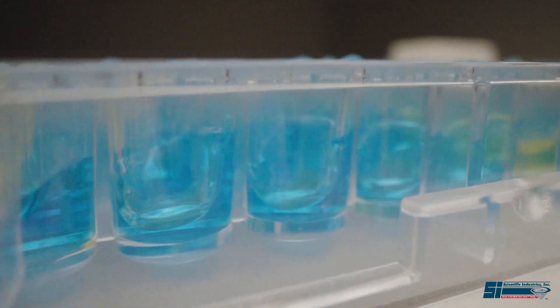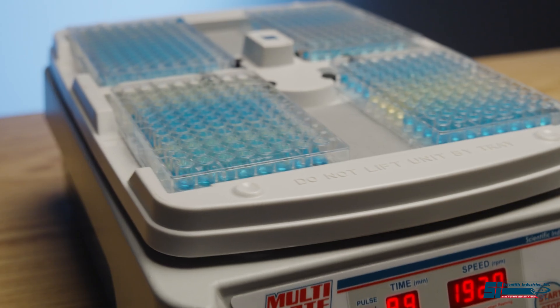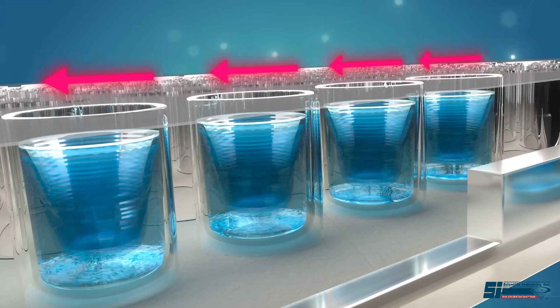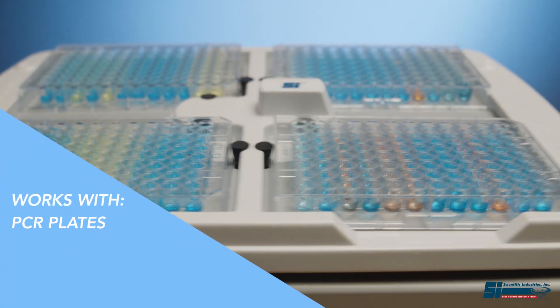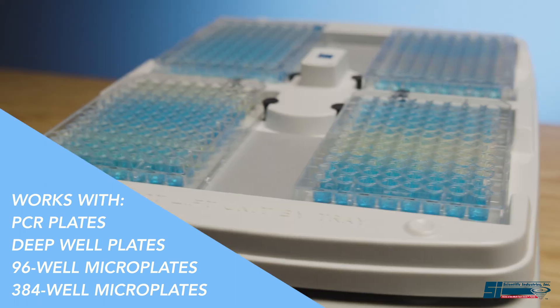With a combined 1mm orbit and programmed speed setting, the MultiPlate Genie provides uniform mixing in each of the wells, even in 384-well plates, for repeatable and reliable results from well to well and plate to plate.